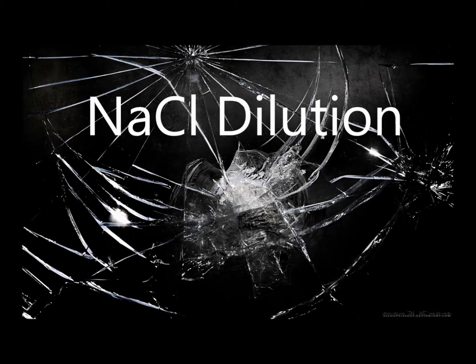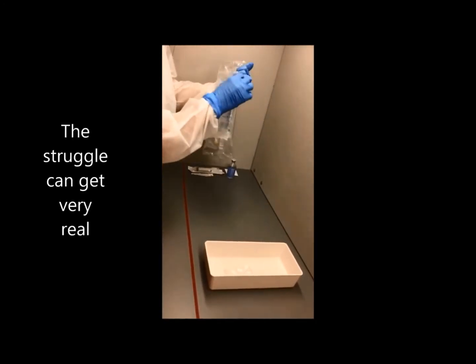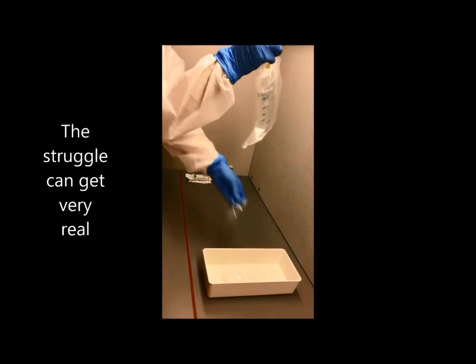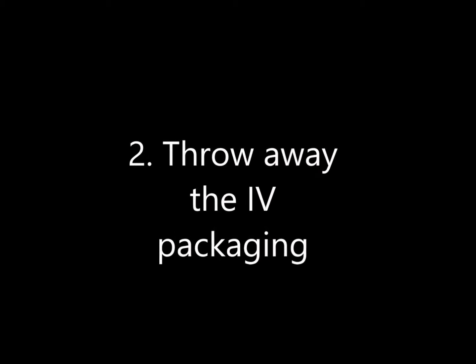Sodium Chloride Dilution. Step 1: Open the IV bag packaging. Yes, the struggle can get very real. Step 2: Throw away the IV packaging.